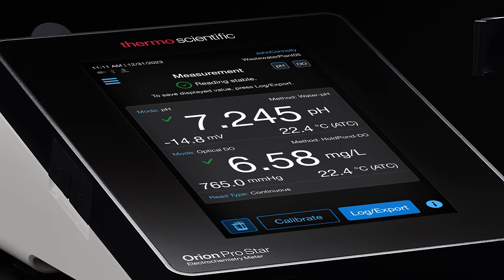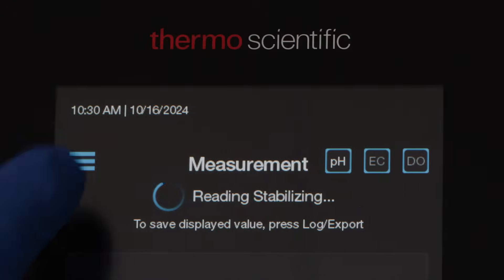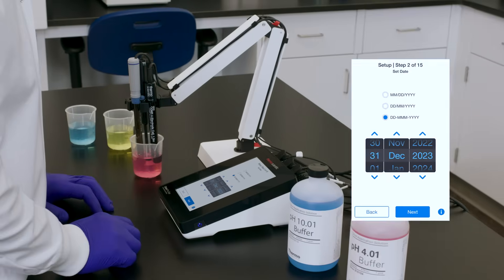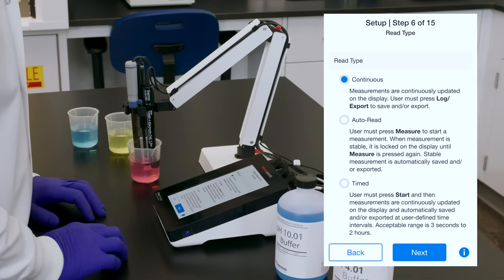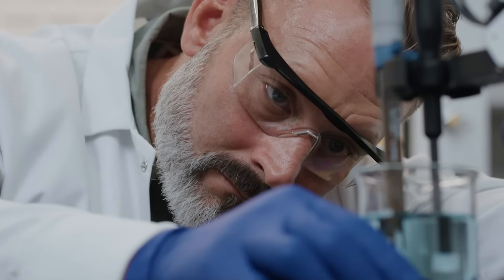Featuring a large 7-inch touchscreen display, intuitive user interface, and guided navigation, see how even the most complex measurements become easy and straightforward.